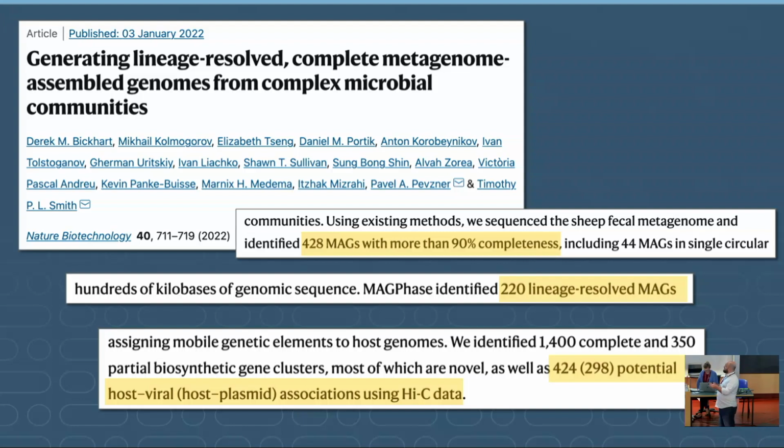In fact, we've done a lot of other work that isn't entirely microbiome. We've done a lot of these hologenome projects where you're simultaneously sequencing by this assay, like an arthropod and its microbiome, and you can separate them out. So I saw a poster outside where folks are using this proximity ligation technology to assemble genomes. Remember, you can use it not only to assemble genomes, but to separate the microbial community from the host as well.